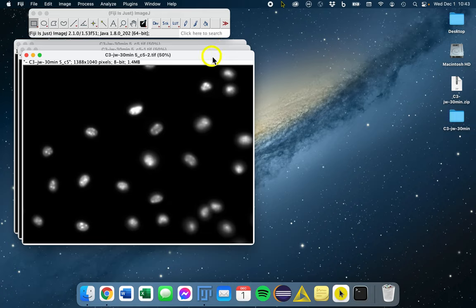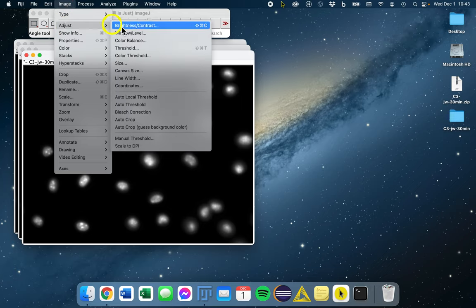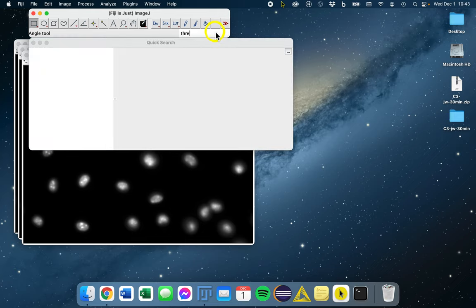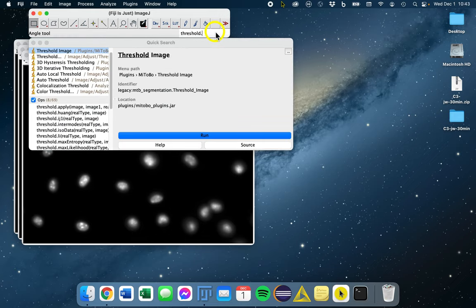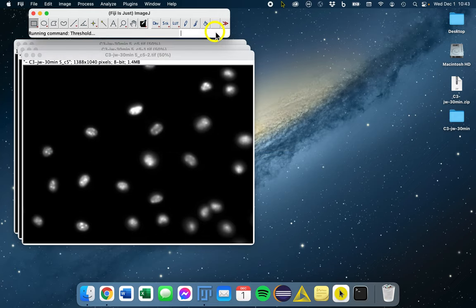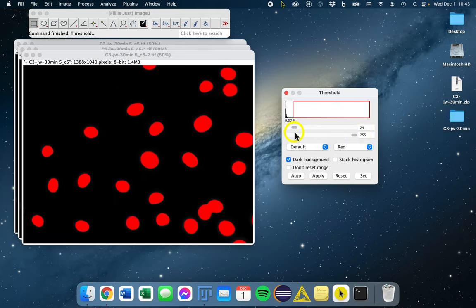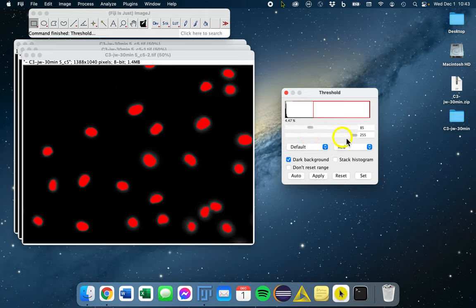To set a threshold, you can go to image, adjust, and threshold, or you can just type threshold in the search bar. So here you can see you can manually adjust your threshold, but this really isn't an ideal way of doing things.